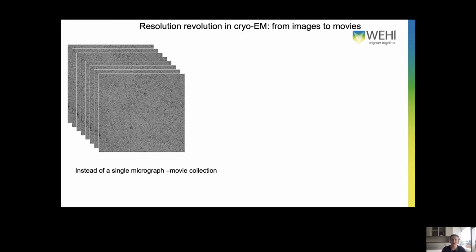So usually they last at least a few seconds, sometimes even fractions of a minute. And because of such long exposures, we can observe movements. So it's sample movement. We also get radiation damage to our sample as we accumulate the dose. So one way to mitigate this, again, is to collect movies instead of stills.